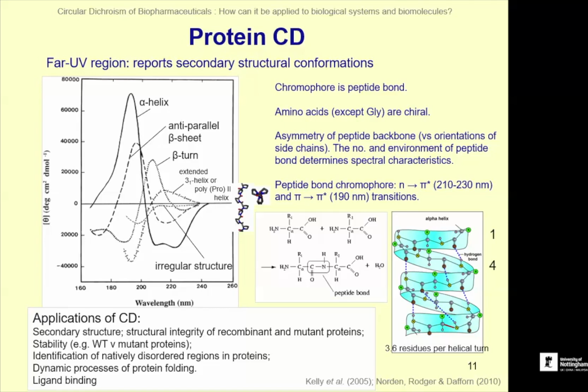So it's hydrogen bonding which forms the alpha helix, which disrupts the environment of the peptide bond, shown here. Carbon-nitrogen peptide, I tried to highlight it here. Here's the peptide bond, and you can see with the proximity of the hydrogen bonding that this changes the environment of that CN bond, and that is what shifts these different spectra to look different to each other, because their secondary structure is different and hydrogen bonded differently.